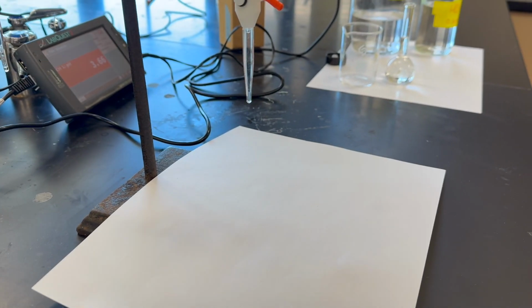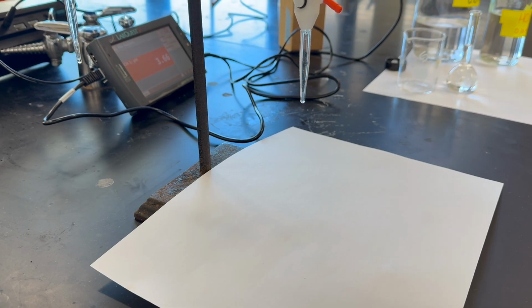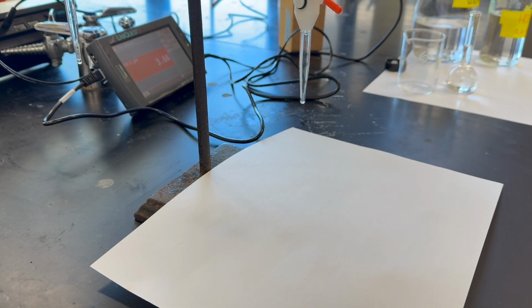And again, this is just as an introduction to titration. And so we have a burette, which is primed and filled with sodium hydroxide at 0.1 molar.